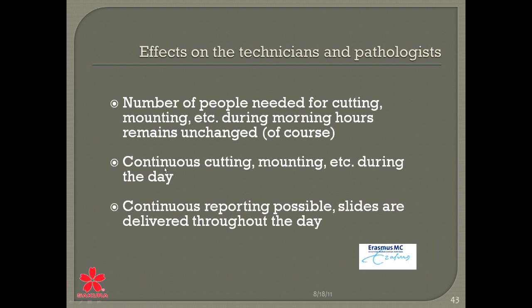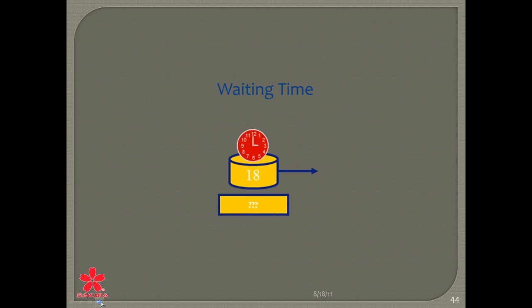So what I said already, continuous cutting and mounting, etc. during the day, but also continuous reporting by the pathologist is possible, and then you get the same-day diagnosis, which is really important for our patients.